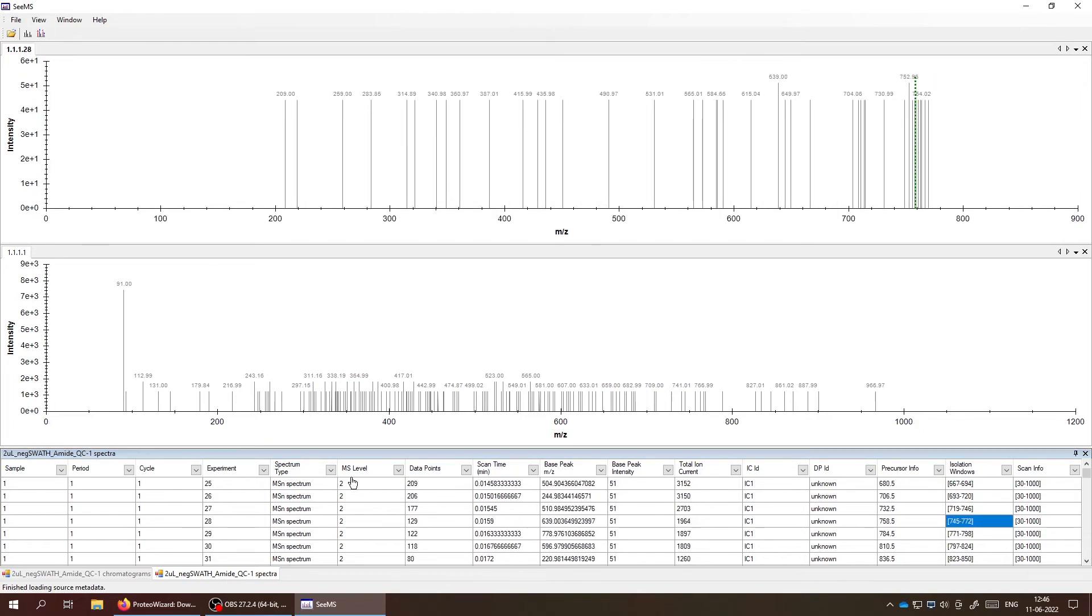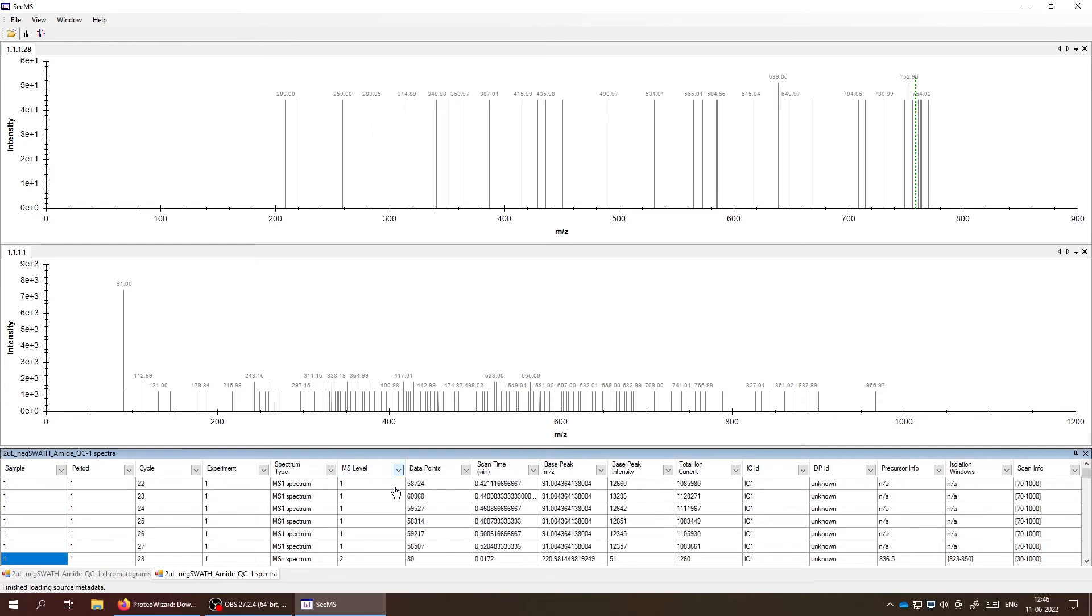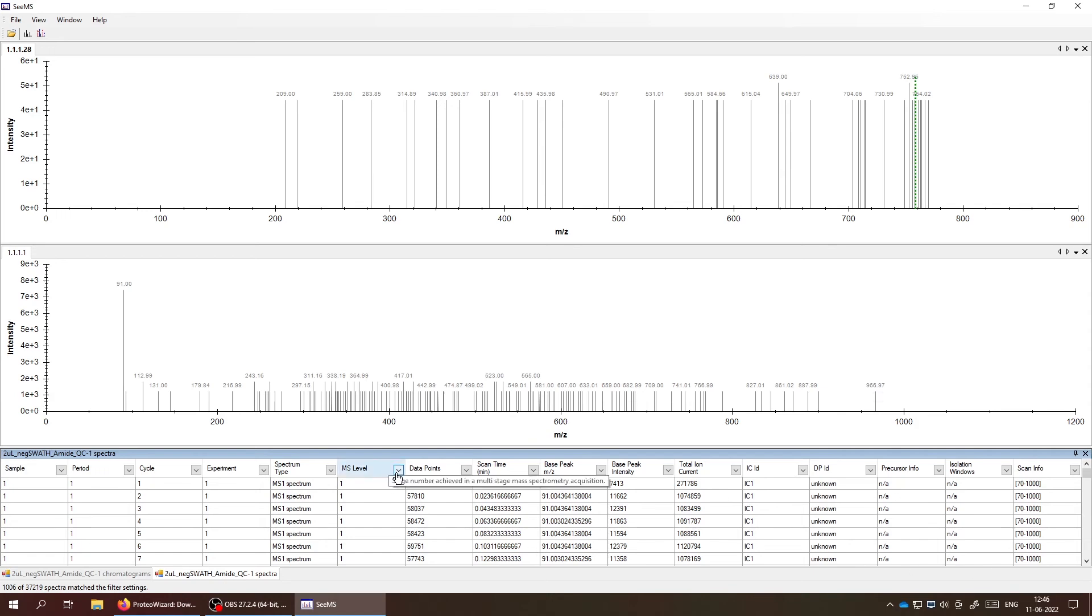You can also filter the data based on different parameters here. So if you just want to see the MS1 information - by the way, this is SWATH data. So we have, I think 30, 34 windows, 37 windows in each cycle.